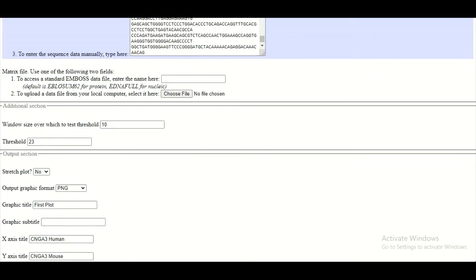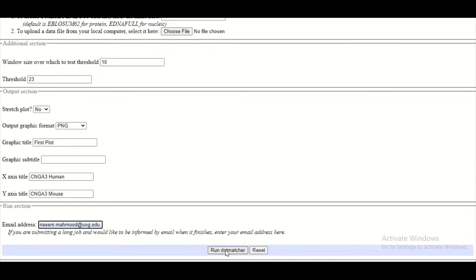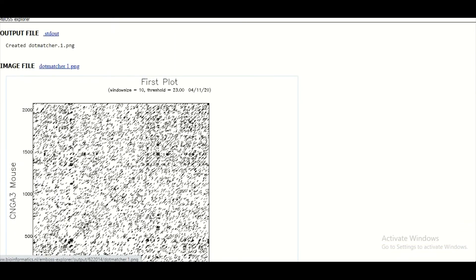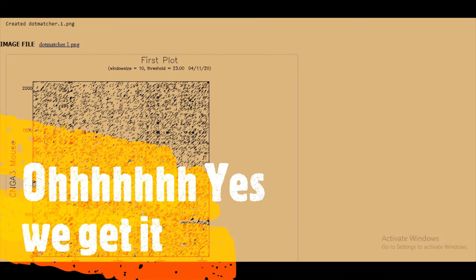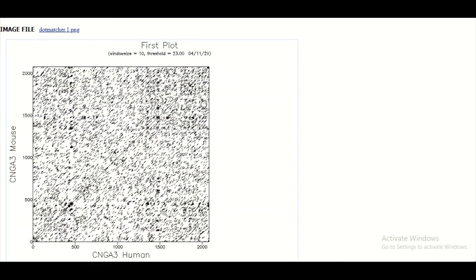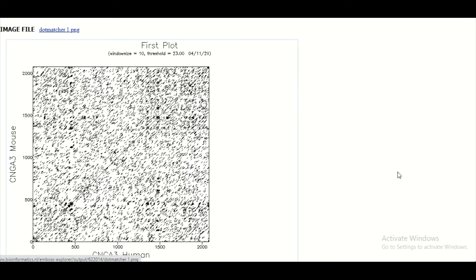After filling out all of these boxes, you simply click on the Run Dot Matcher button, and when you click it, it may take a few seconds and then you will have your dot matcher plot. This is your dot matcher plot, and here on this dot matcher plot you can see a lot of black colored dots or black colored lines. Now what these lines are telling you and how you can interpret this graph is very important, so let's try to understand this graph.